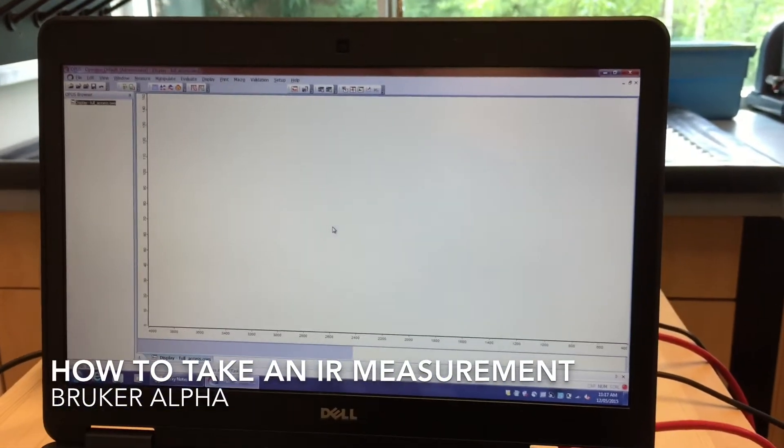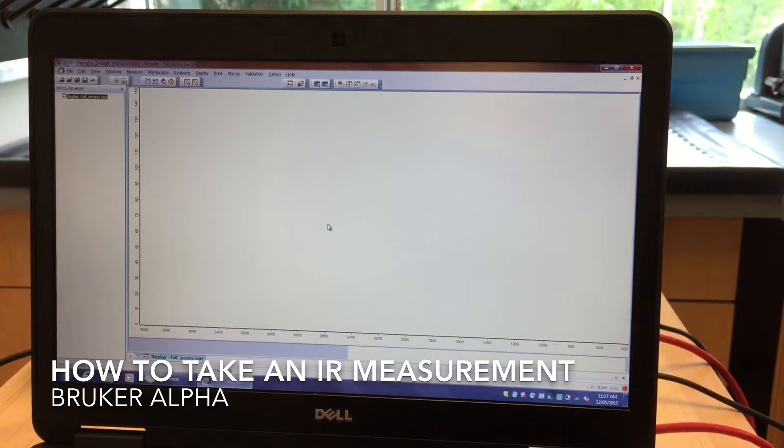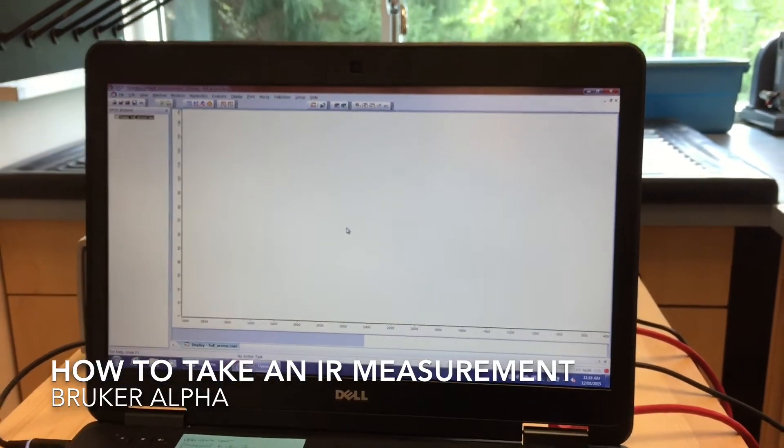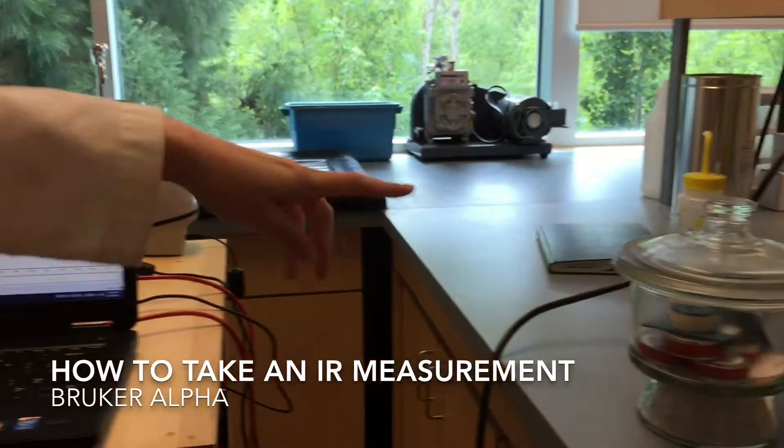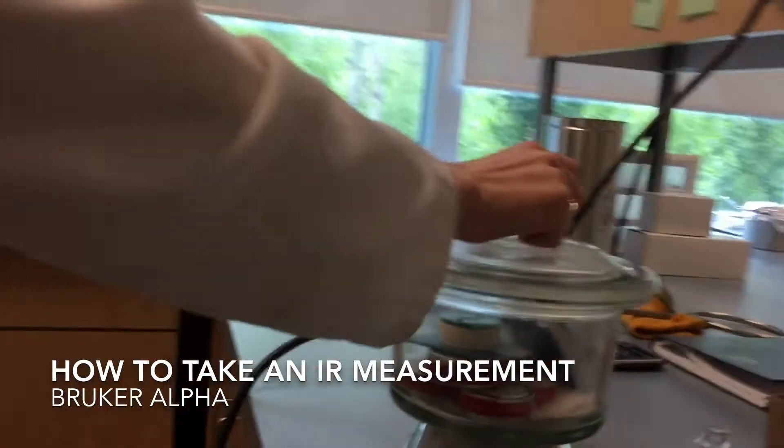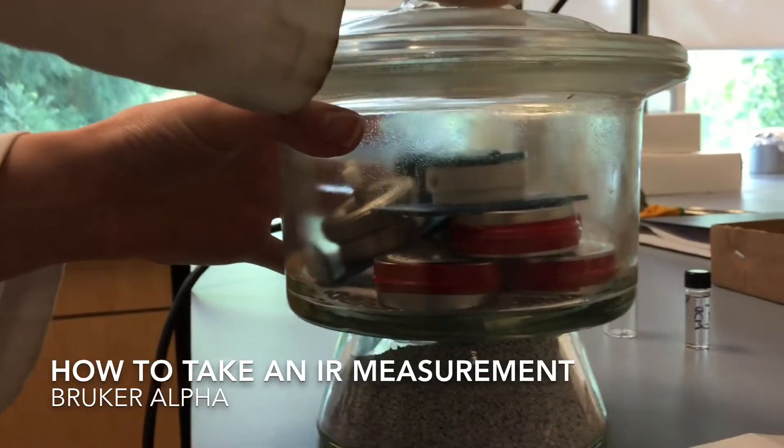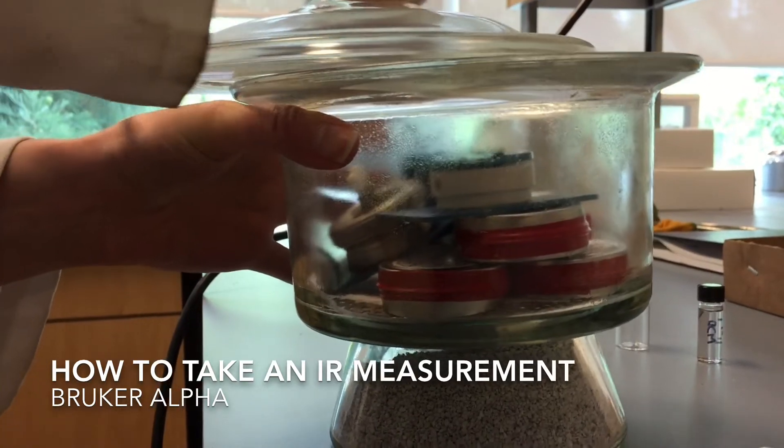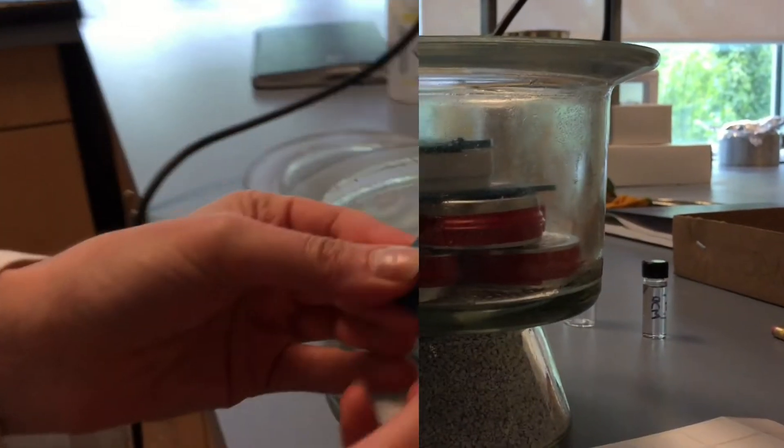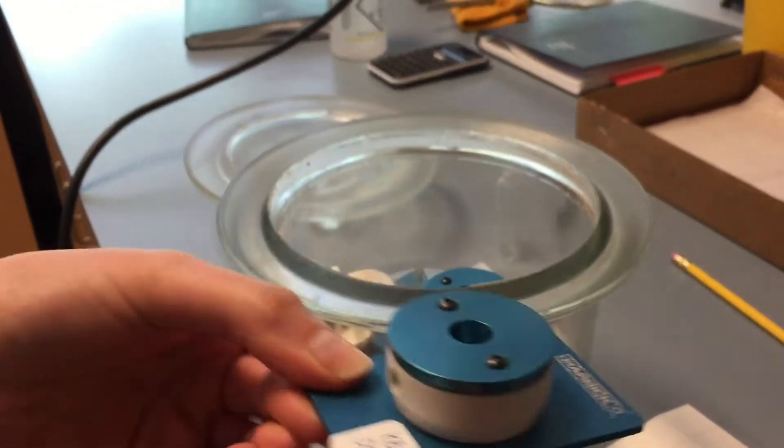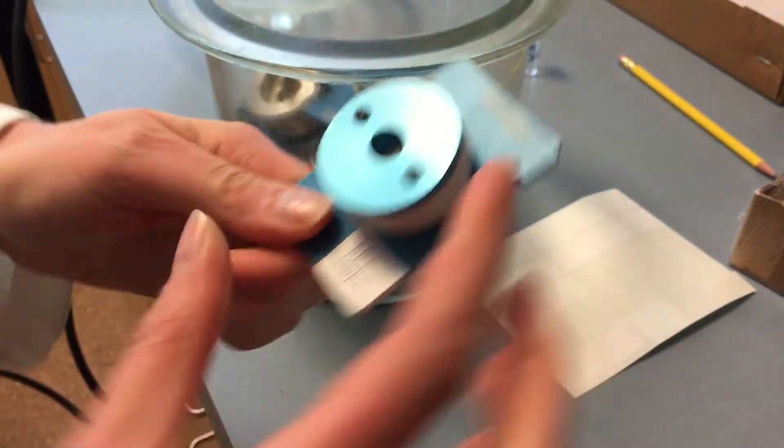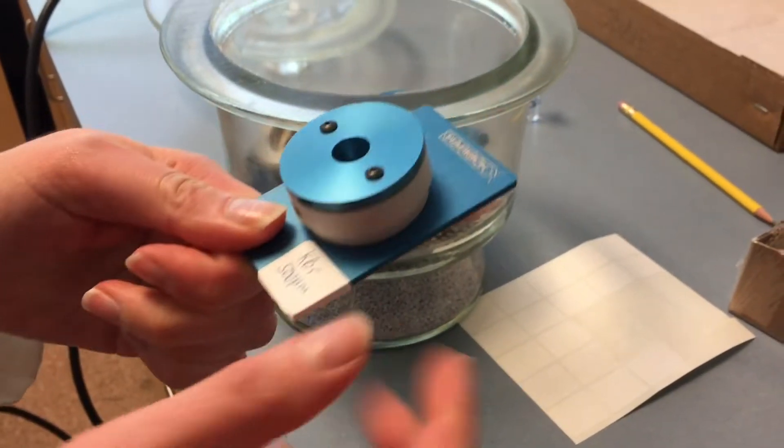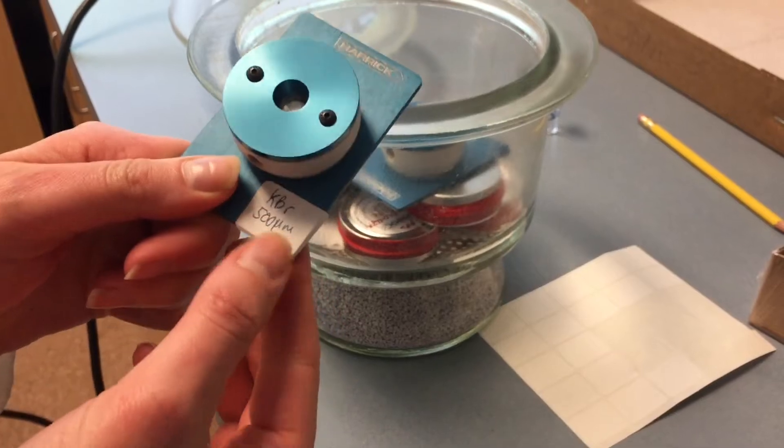Now we can choose a cell in order to make a measurement. All of our IR cells are kept in this desiccator. Here's a flow cell. We can attach HVLC fittings to both ends and flow solution through there.